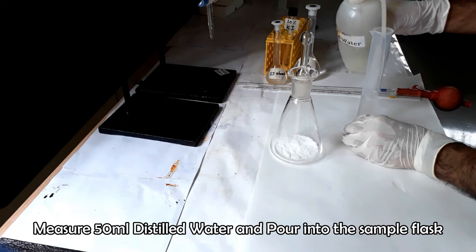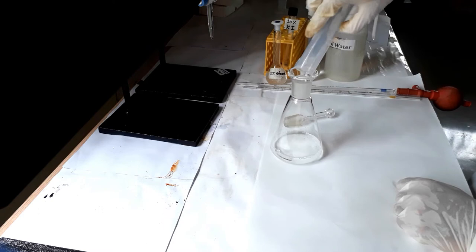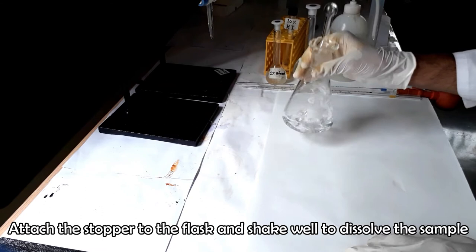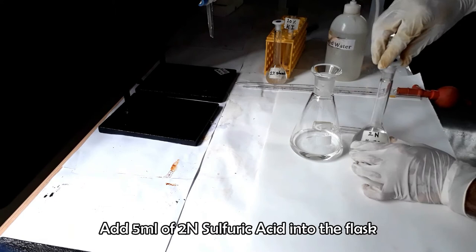Measure 50 ml distilled water and pour into the flask containing the salt sample. Shake and rotate the flask to dissolve the sample in water completely. Now add 5 ml of 2 normal sulfuric acid.